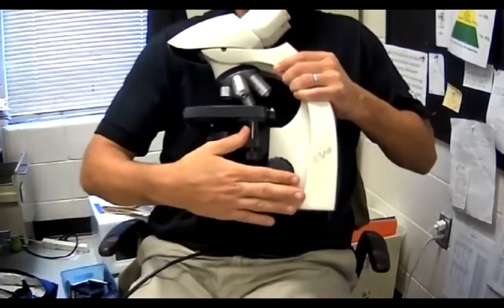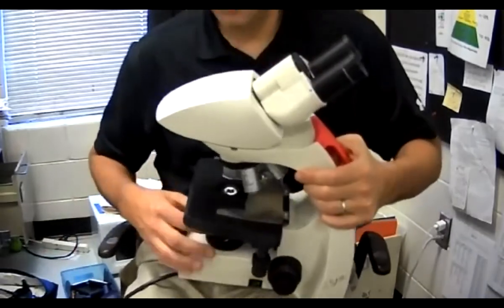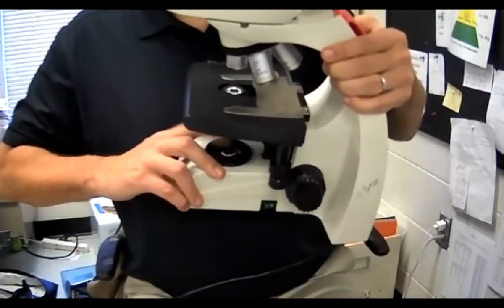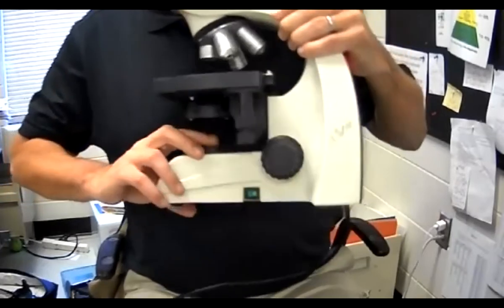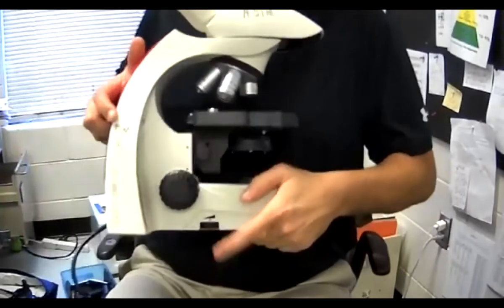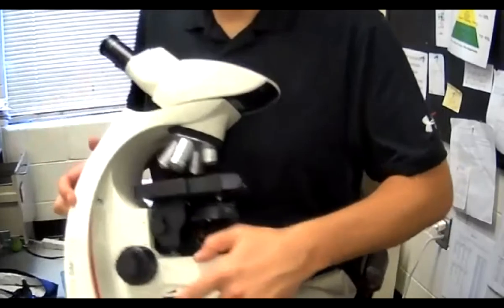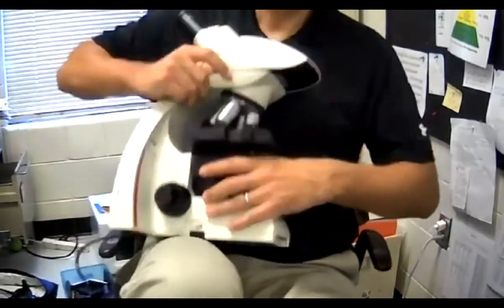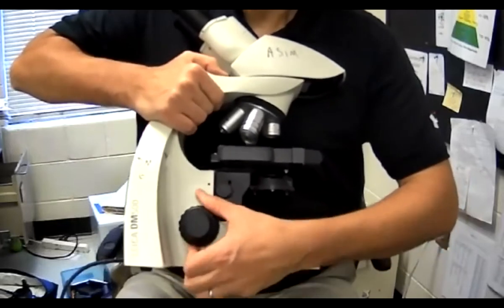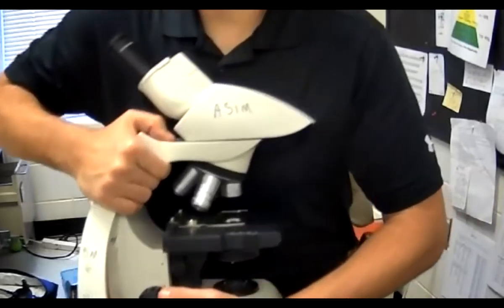So those are some of the parts. The bottom is called the base. This thing right here is called the lamp. Over here is the illumination control switch. The big knob is called the coarse adjustment and the little knob is the fine adjustment.